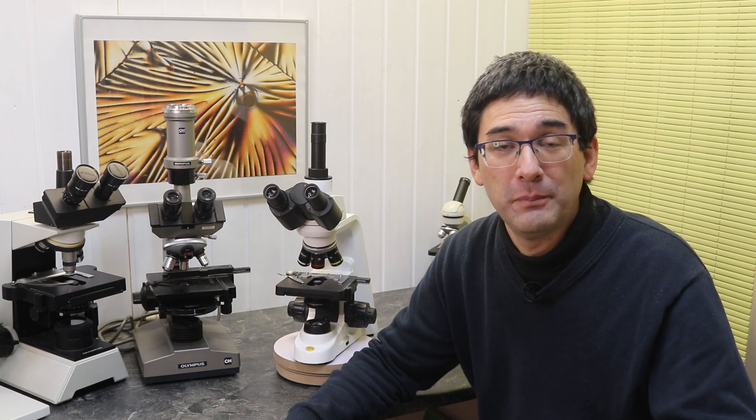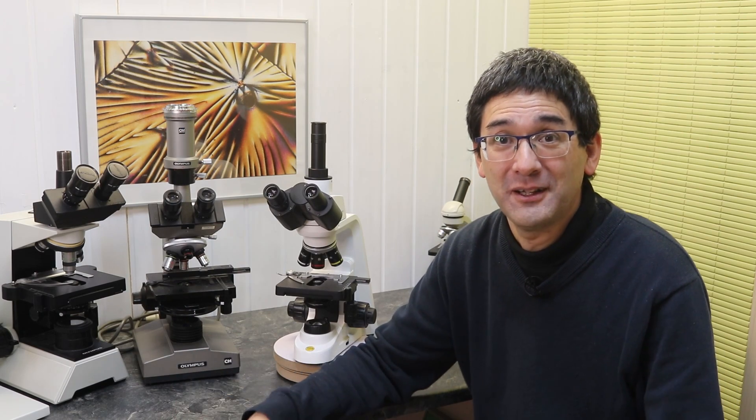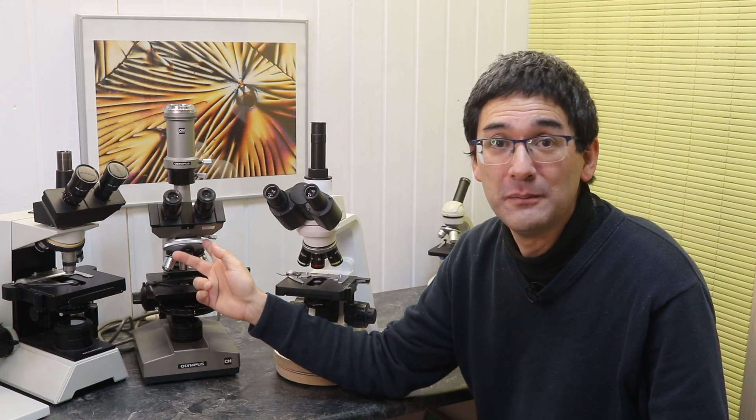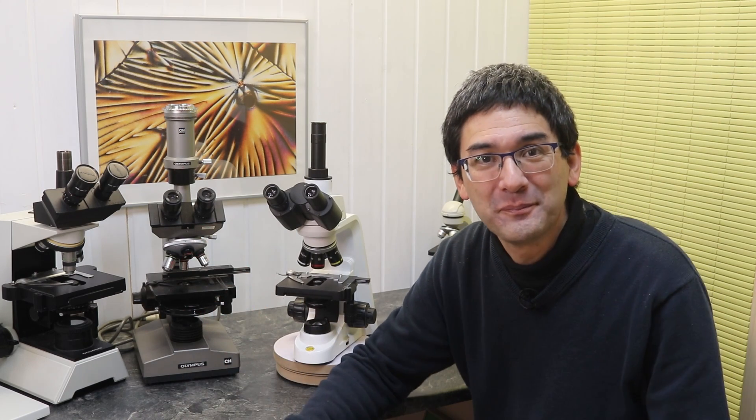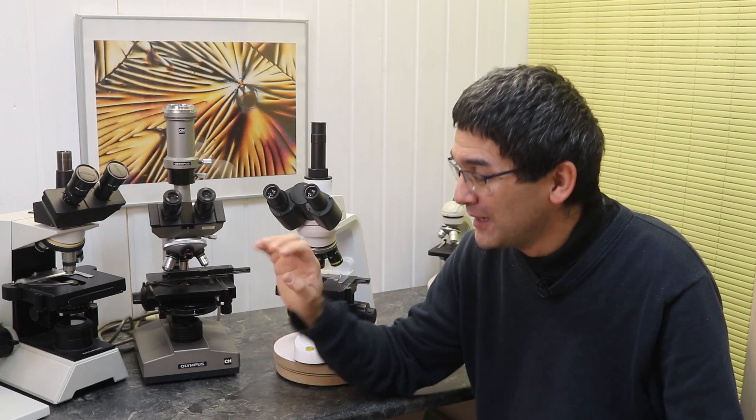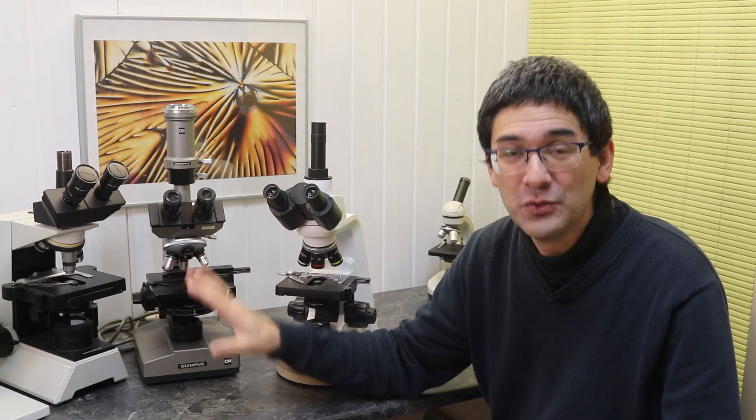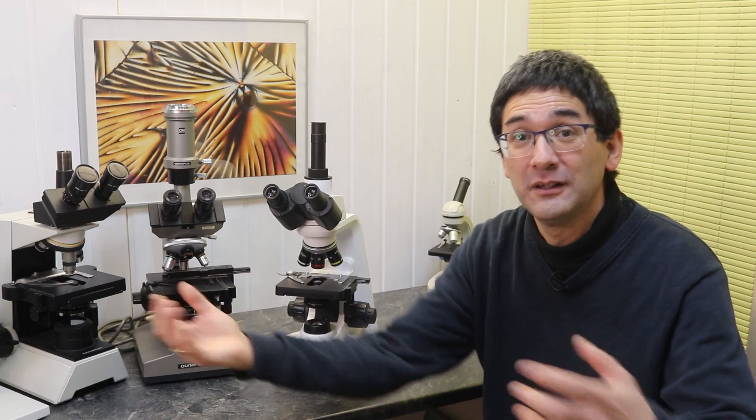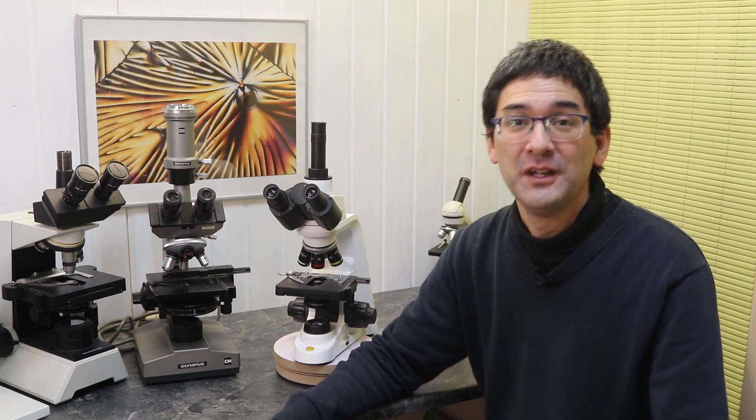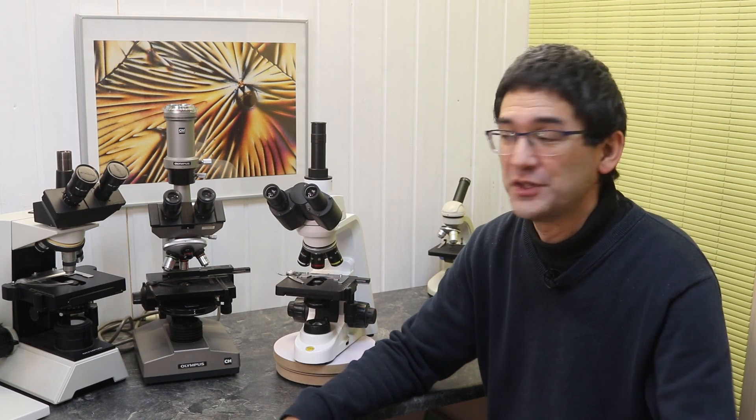If it's a used one and you buy it over eBay you don't know what you're getting. Some people say that's fine because I'll just fix it myself and I'll exchange the optics. It's also an advantage here because if you replace the optics you have new optics as well, because it's a 160 millimeter system. Are you more the hands-on type of person that would like to dig in deep into microscopy, also on the hardware aspect? Then you probably also want to buy maybe a used model. And then it takes a little bit more time until you've got all the parts together. Or you just want to do uncomplicated nature observation out of the box. Then I would say seriously also consider getting a new one.